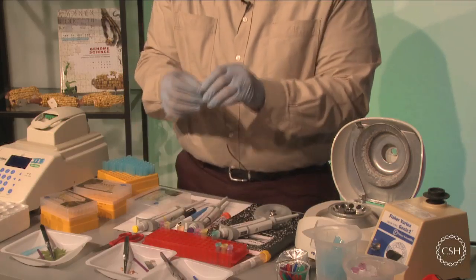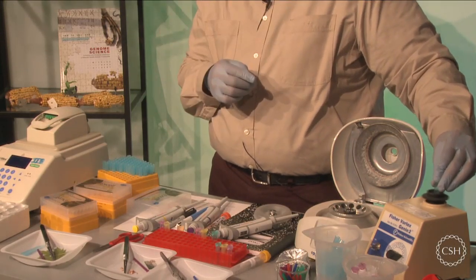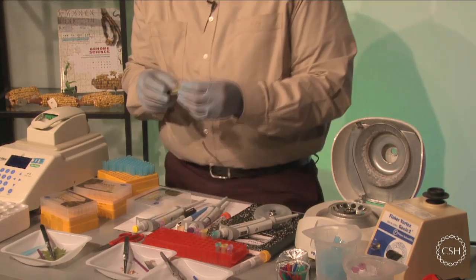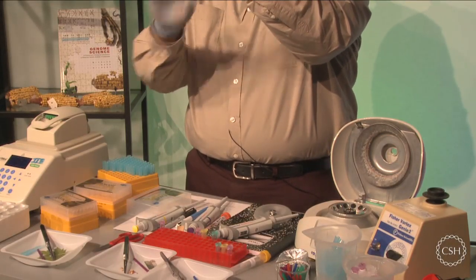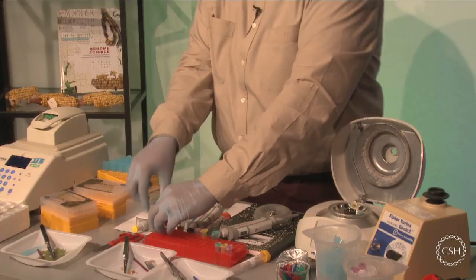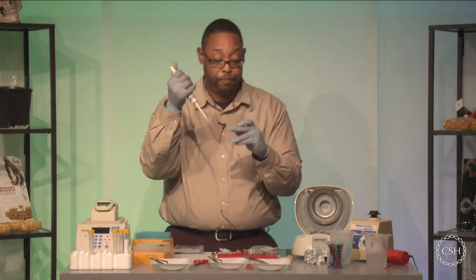Okay, and again, you're going to want to make sure that you get the pellet resuspended. And then place it back into the centrifuge, because we are going to have to pellet it once more. Okay, you can use just a vortexer, but you can also hand vortex, get things to lift up. And then, of course, you can pipette up and down as well.